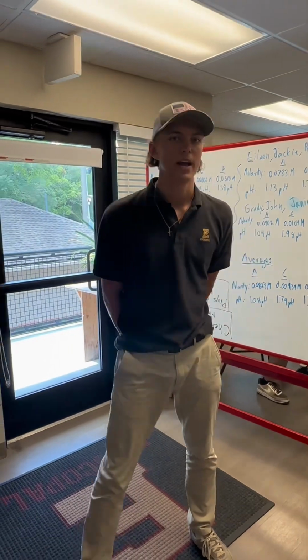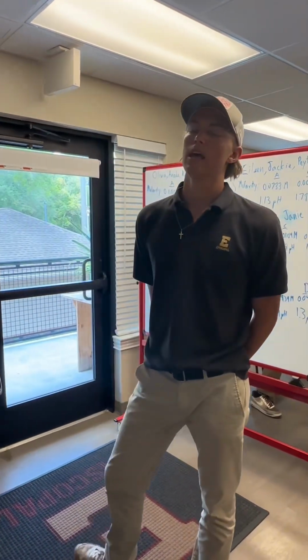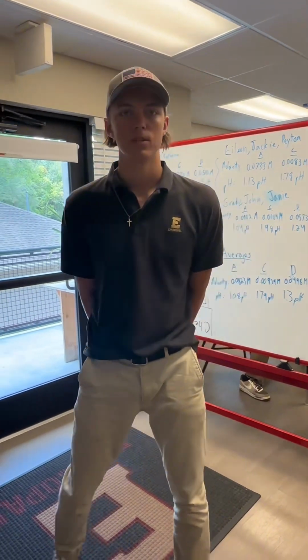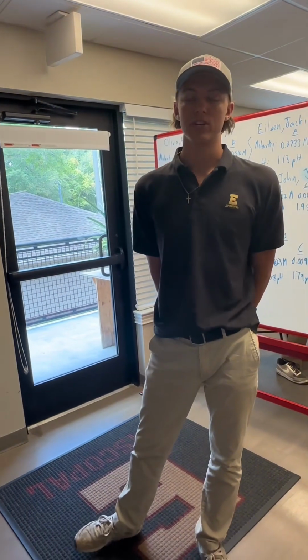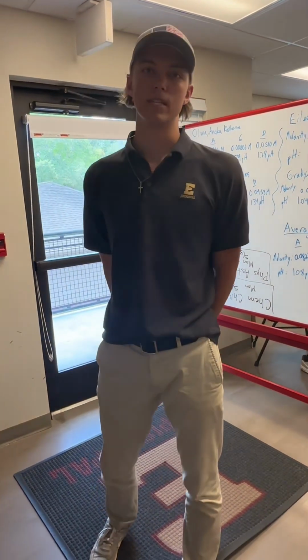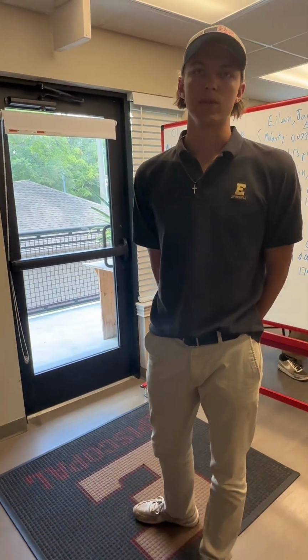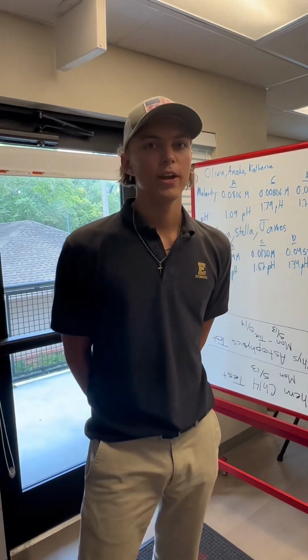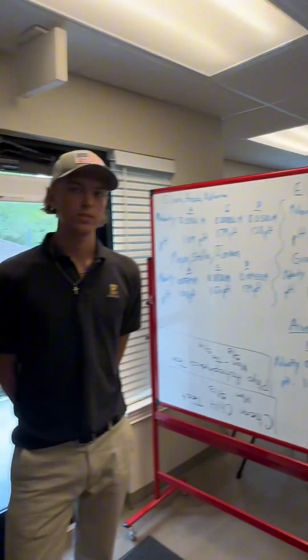Some possible reasons behind differences in numbers are errors such as personal errors, like non-exact base amounts for reactions to be completed, random errors such as different titration burettes causing different numbers, and systematic errors such as not being able to see the numbers or lines on the burette, so numbers had to be rounded. Although the errors are very small, that is what causes our numbers to be slightly different than all these other groups and the average.